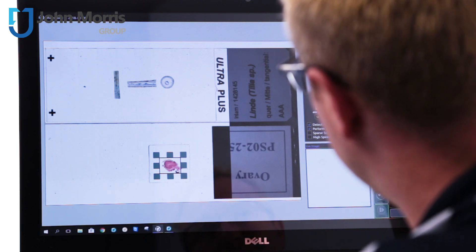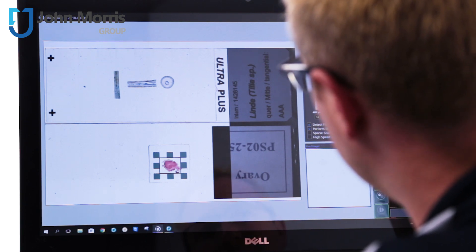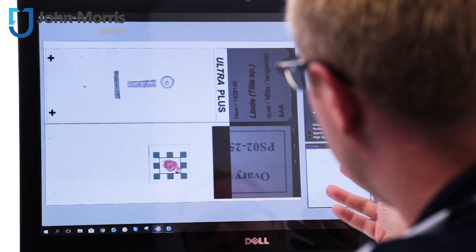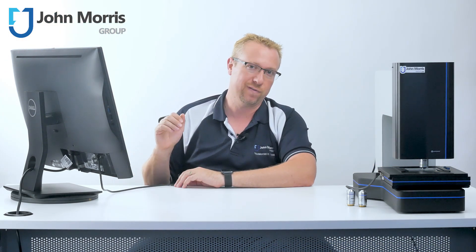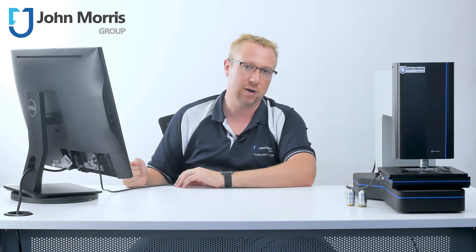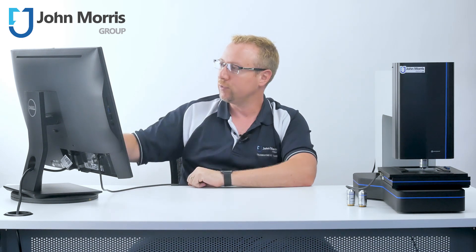Before we start you can see there's a range of different focuses you have here and it ranges between extraordinarily detailed focus which takes you a little bit longer or a single point focus where you can determine one point of focus and it will rapidly scan all the way through. At this point in time we've got it set to intelligent focus and that's a good kind of midway point between everything. So let's go.